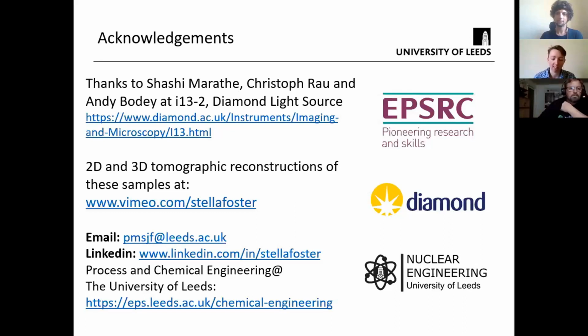Well, answers always create questions. So the temperature of the pyrolysis was 375 C, I seem to note? Yes. In both cases? In both cases, yes. Okay. I think your future work will be very insightful as to the different starting material. Spent coffee grounds is an odd choice, although a readily available one around academic circles because of all the coffee drinkers. Sure.